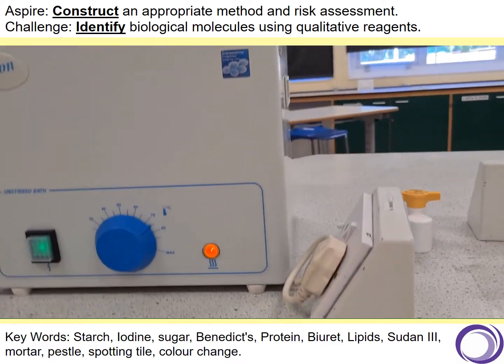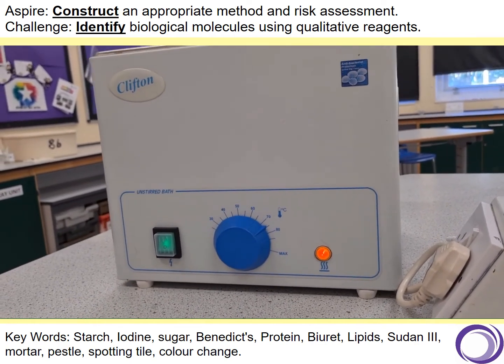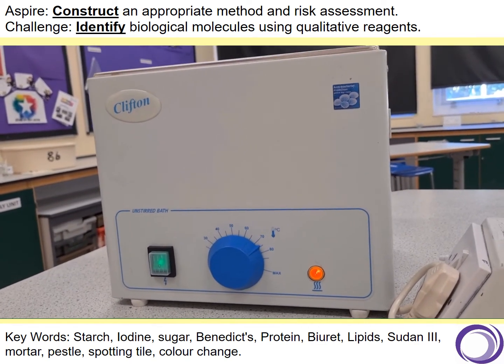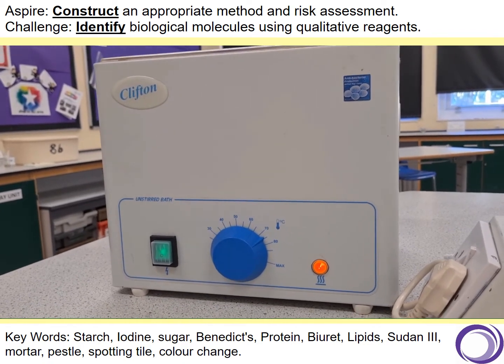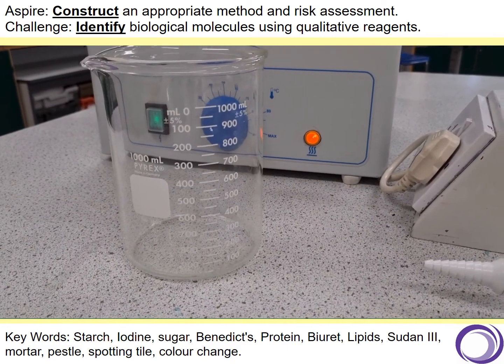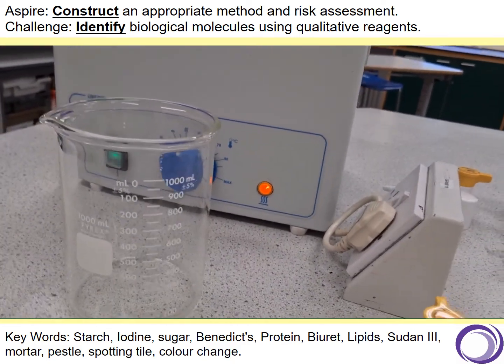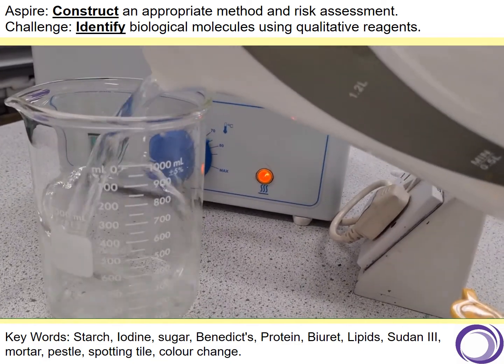If for some reason you don't have a hot water bath, you can make a hot water bath, and AQA like you to know about this. So to make a hot water bath, it's very, very easy. You get a big measuring jug, and you are going to add your hot water straight into there.